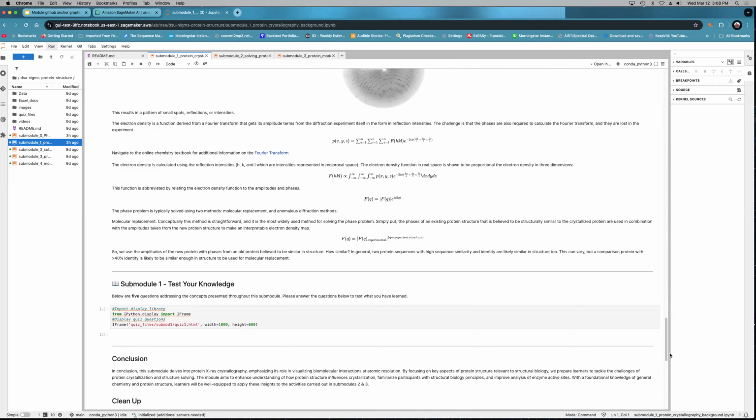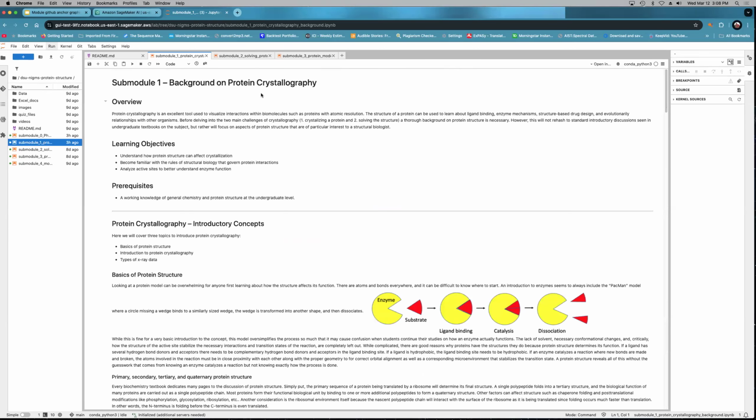So the initial module is just background in crystallography, hopefully from a perspective that's different than a typical biochemistry text would do. Certainly don't need a rehash of, well, here's a protein, but I certainly do think that there are some specific considerations that are involved in crystallography that I've covered here that should help couch the challenges that we see when dealing with crystallography.